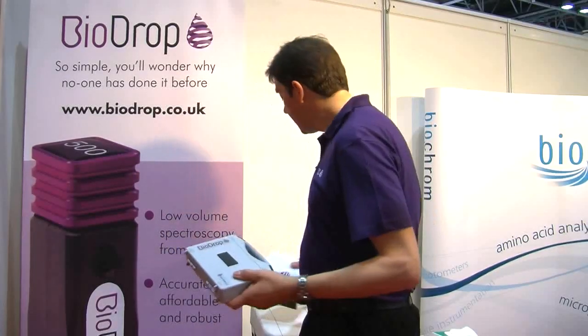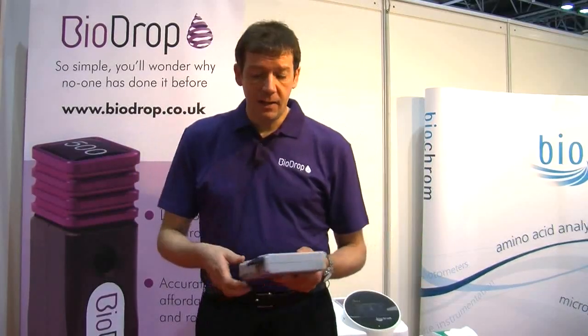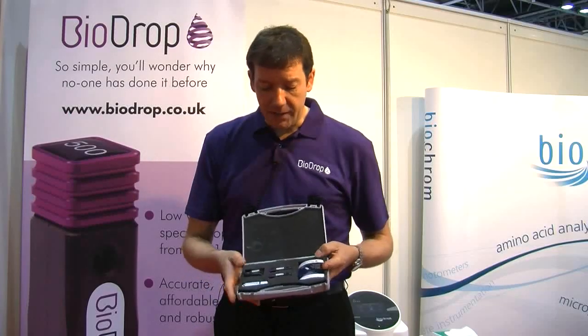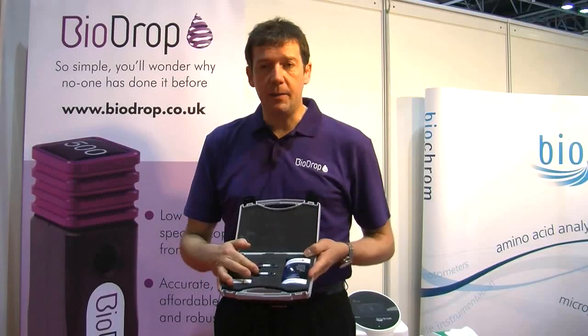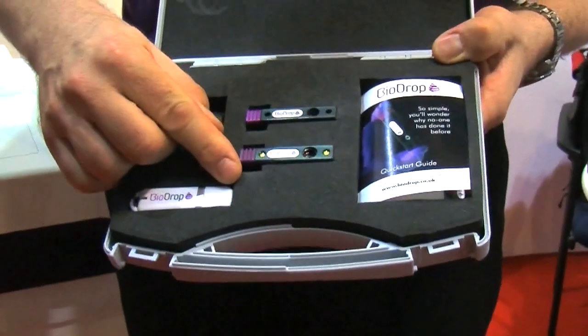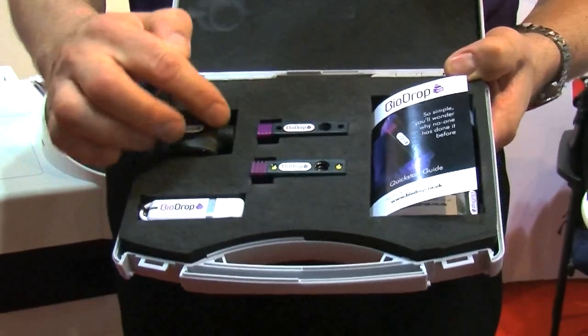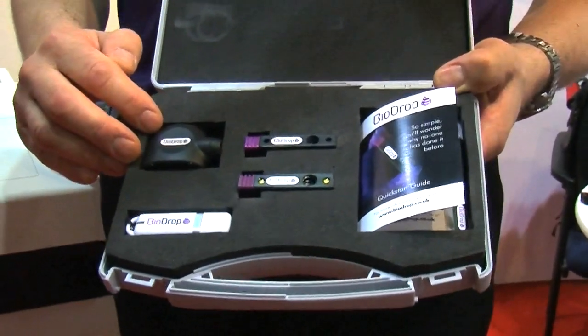The product itself comes in a small carrier case. What you get is two of these BioDrop low volume devices, a user's guide, some manuals on a memory stick, and this thing here which is the unique bubble viewer.